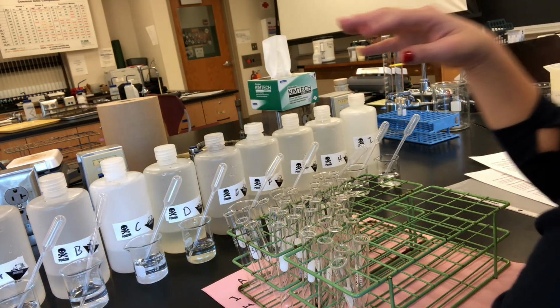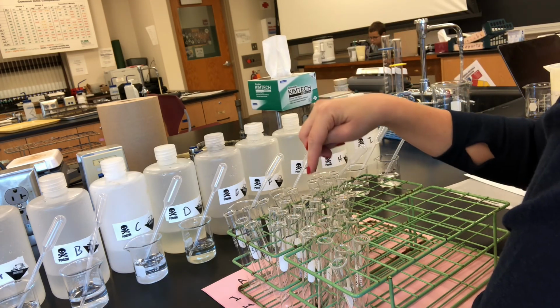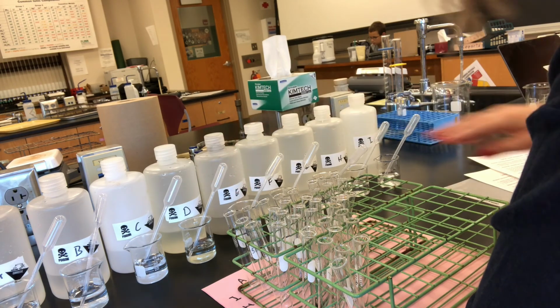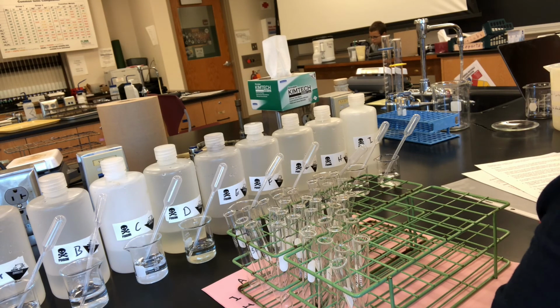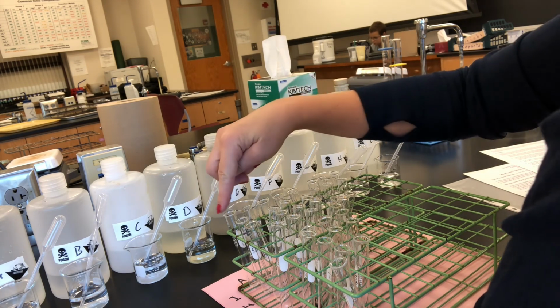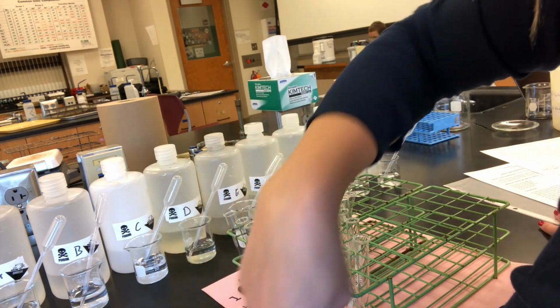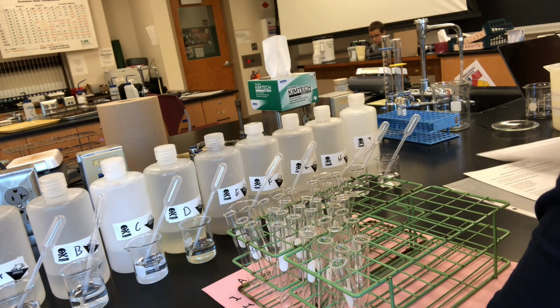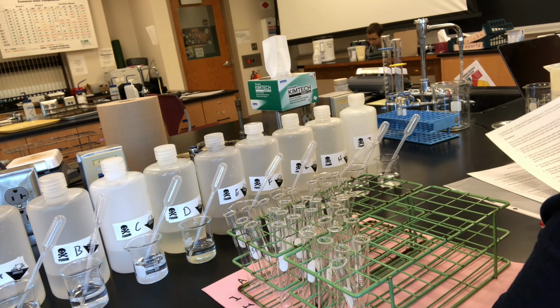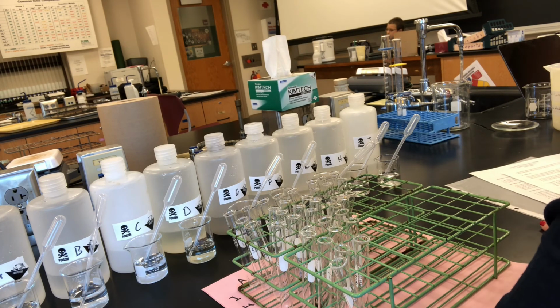I've also set up a grid, which I'll put a picture of at the end, I think. I've set up a grid of my unknowns, just like the one on page 2 of your lab report, labeled A through H here, and then I through B here. So we're going to go through and mix our unknowns together, mixing each unknown with each other unknown, checking for precipitates being formed.